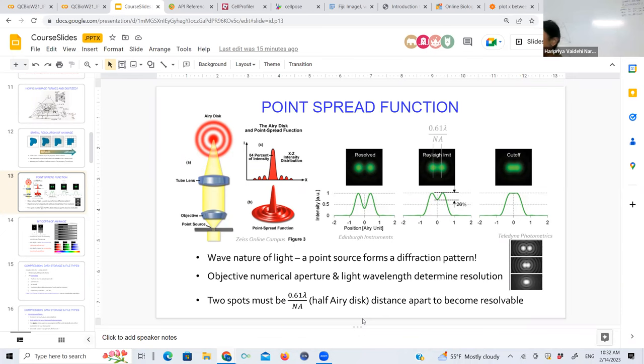So when you pick up a microscope lens, you will see a number on it. You will see, say, magnification 20x, which is the image is blown up 20 times. But you'll also see slash something NA. And that something NA is your numerical aperture. So if you have 20x/0.3 NA versus 20x/0.8 NA, the 0.8 NA is nicer because it's picking up much more light. The 0.3 is going to do this. The 0.8 is going to do this. So you're going to collect a lot more photons and a lot more signal. So when you're imaging, try to use high numerical aperture objectives, especially if you're doing confocal imaging or IHC slices, and you really want to see features, try to go for high NA objectives.